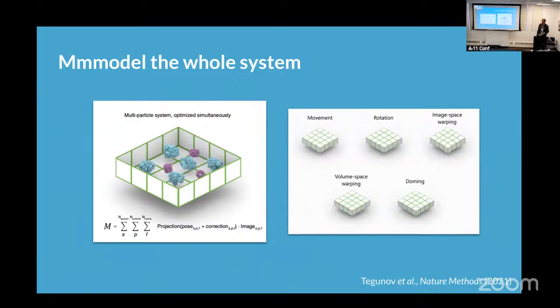And then for frame series data, M really tries to embody this tilt series and frame series of the same thing ideology. And so you can do both in there, although people use it much more for tomography data processing. In frame series, you can model this thing called doming, which is this idea that as you expose your thin film sample to the electron beam, it deforms like this. And so the particles in the center will move just straight up. Particles, as you go further out, will start to move out a little bit. Defocuses will change because of this deformation.